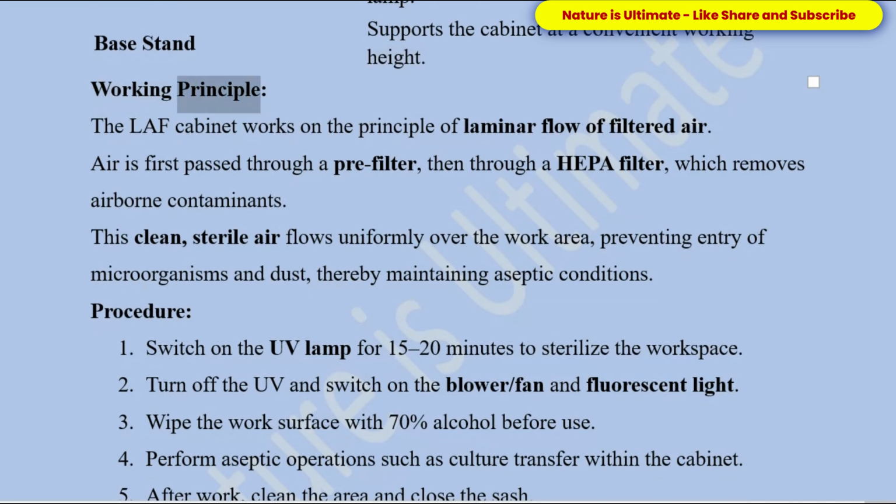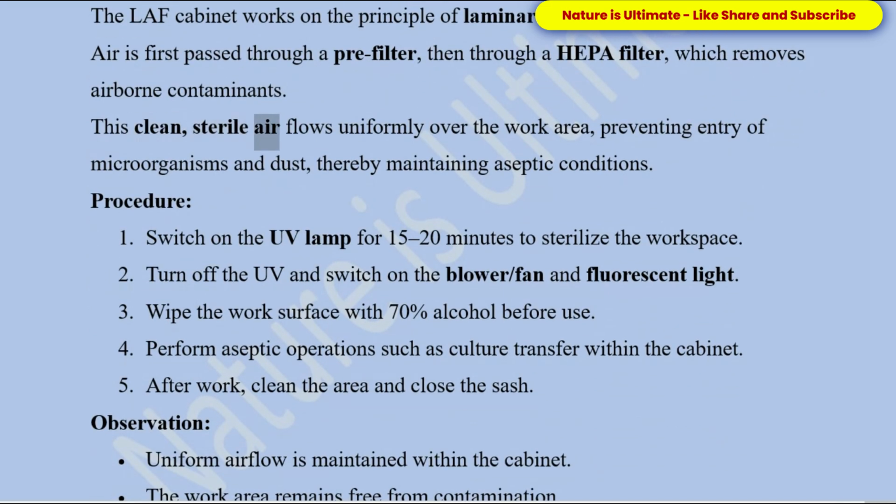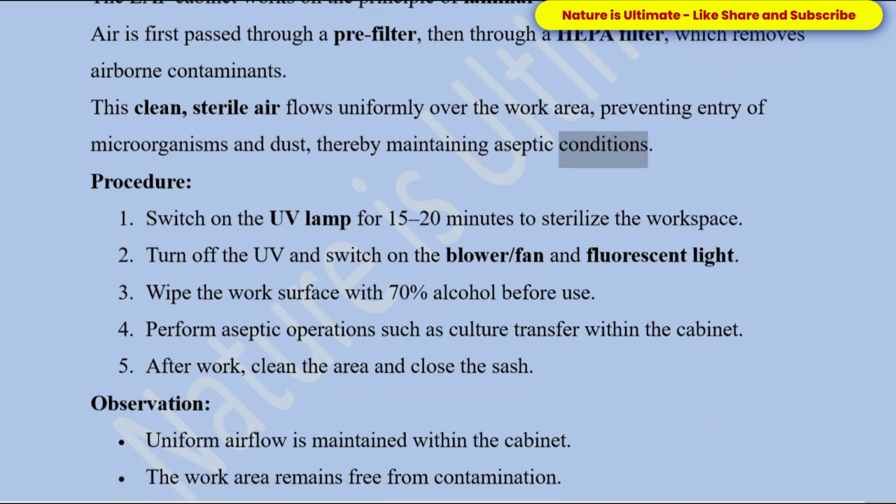Working principle. The LAF cabinet works on the principle of laminar flow of filtered air. Air is first passed through a pre-filter, then through a HEPA filter, which removes airborne contaminants. This clean, sterile air flows uniformly over the work area, preventing entry of microorganisms and dust, thereby maintaining aseptic conditions.